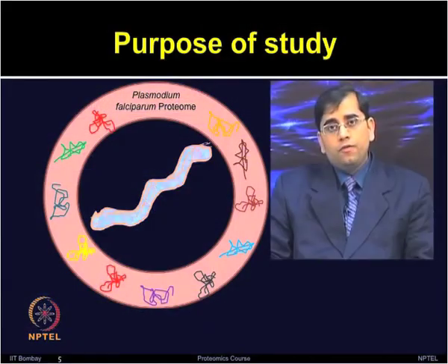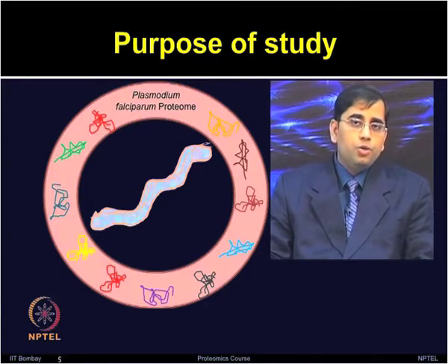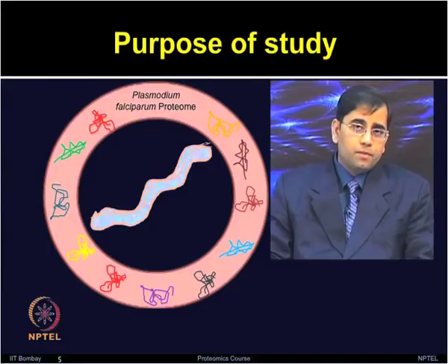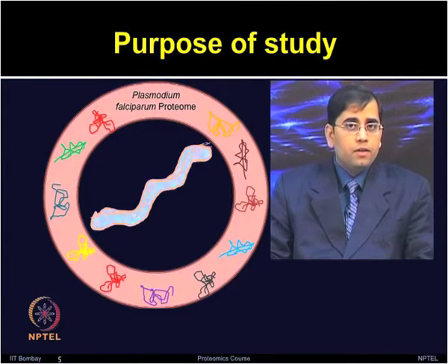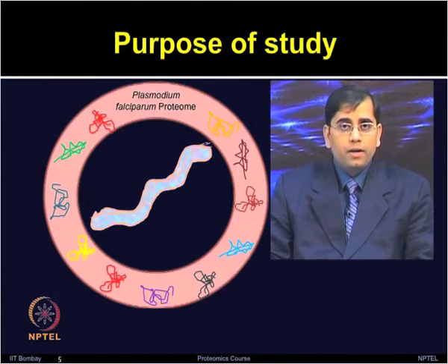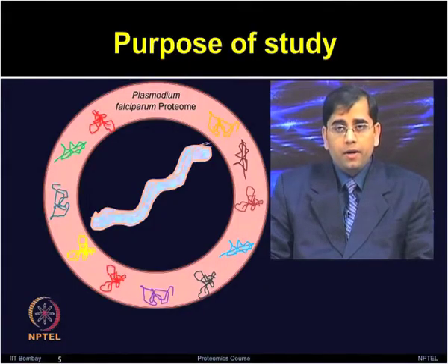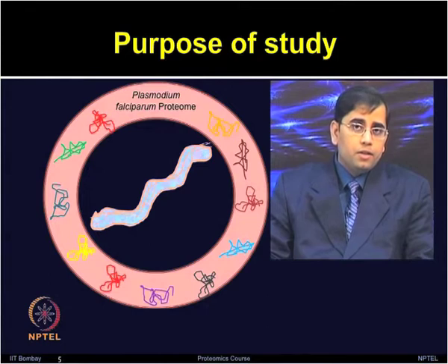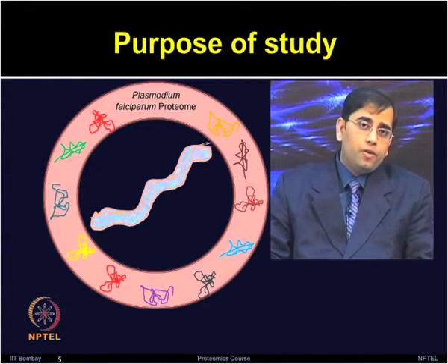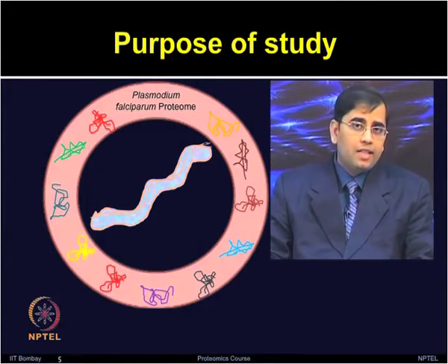To obtain insight into the proteomic alteration, they separated the proteins on two-dimensional electrophoresis gels and compared the responses to these two drugs. Then they identified certain proteins which were either commonly expressed due to these drugs or differentially expressed. Certain proteins were found to be commonly upregulated due to both drugs, and certain proteins showed different patterns.